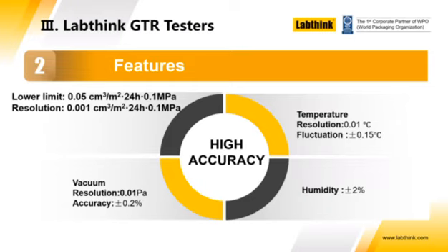But as I mentioned, this is a research and development method, and so some scientists or customers would be interested in the effects of humidity on transmission rate, and so some of the equipment that we offer has the option of a humidity generator or humidifier to create those conditions of humidity. And these factors or features altogether contribute to the high accuracy of the test.